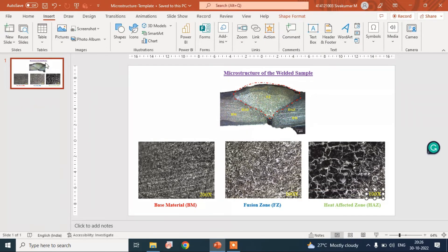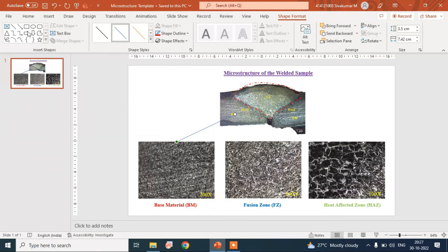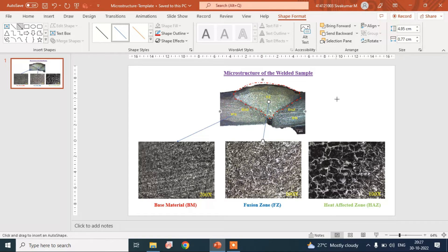Put an arrow mark for the corresponding regions: base material, then fusion zone, then heat affected zone.